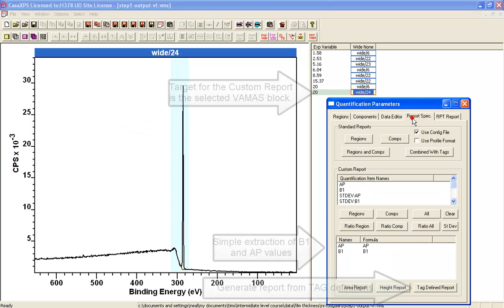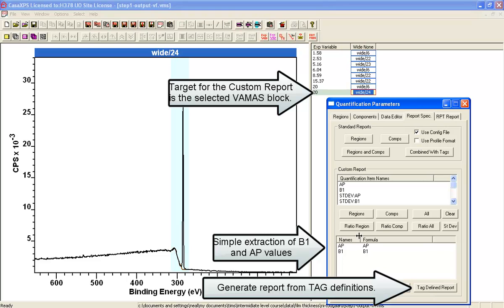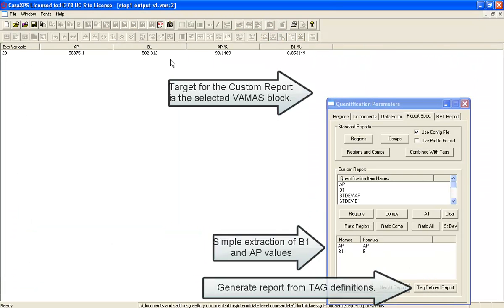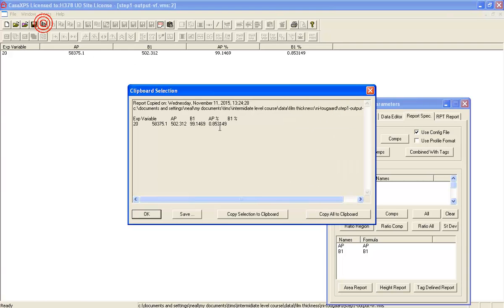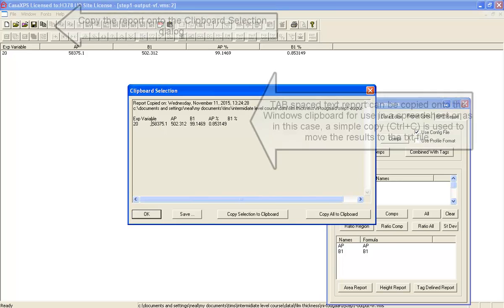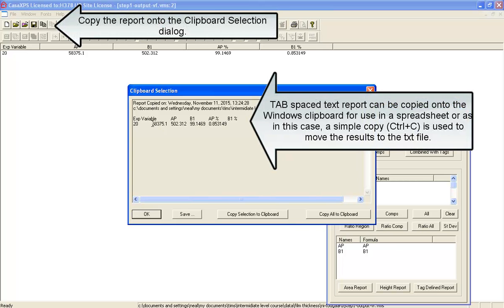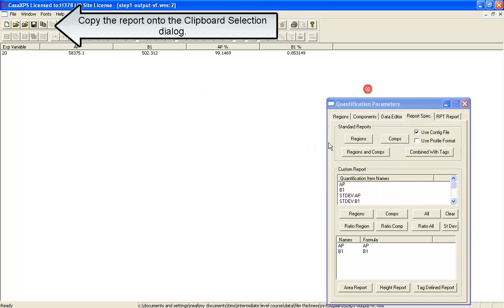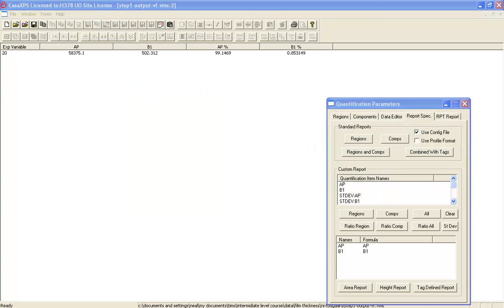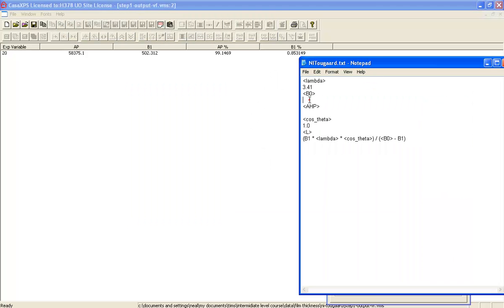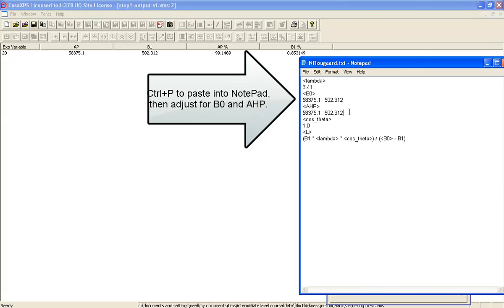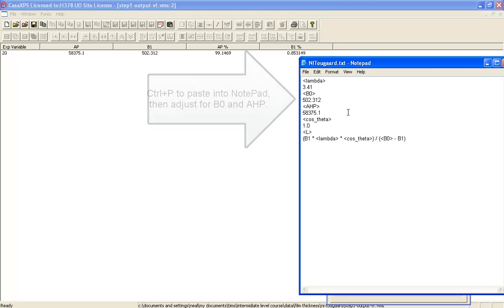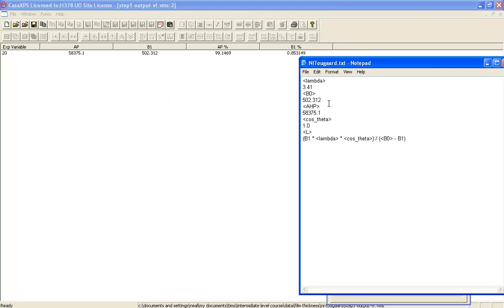So go to the report spec. These are already set up. Press the tag report. And there I've got two values. And these values I can copy them, and then we will enter them. This is going to be here and here. So I'll delete the B value and I'll delete the AP value.